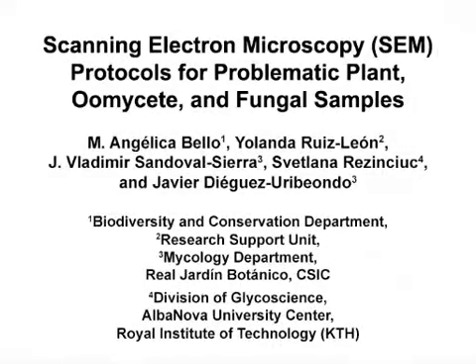The goal of this methodology is to handle delicate tissues from plants, oomycetes, and fungi for their optimal observation under a scanning electron microscope, or SEM.